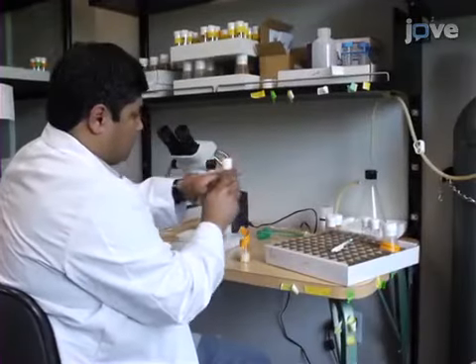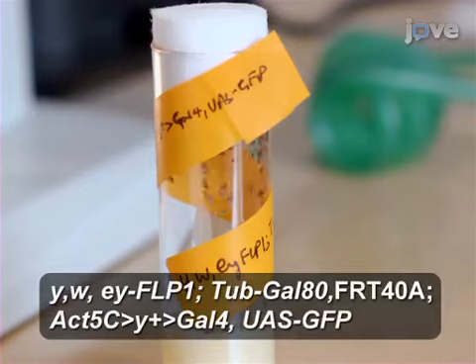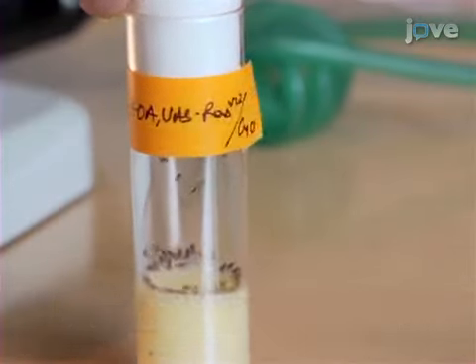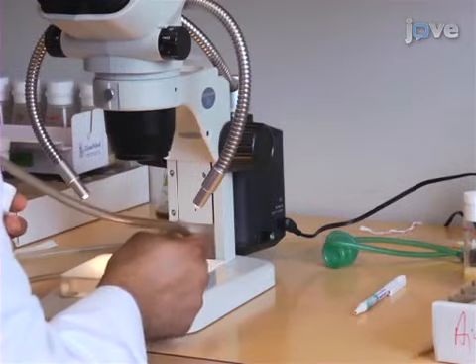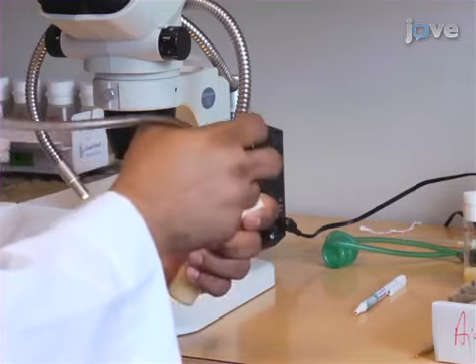Once the required genetic stocks have been obtained, prepare a starter culture of the tester strain. Also prepare a starter culture for the tested stock. Cross 10 female virgins from the tester stock with 10 males from the tested stock.